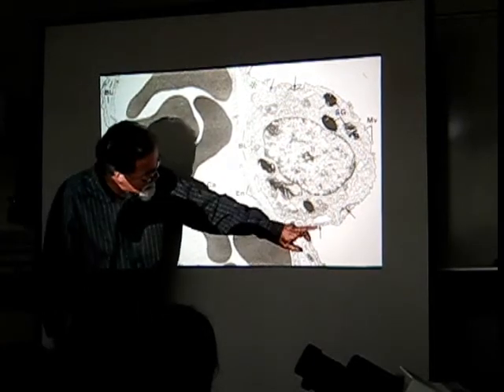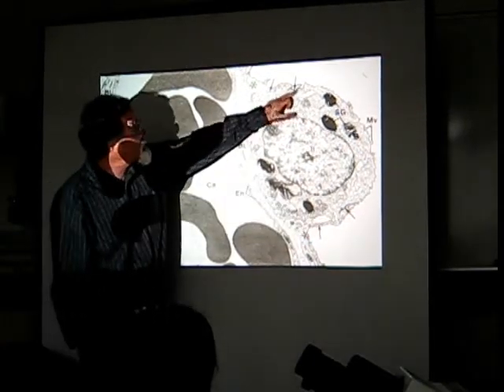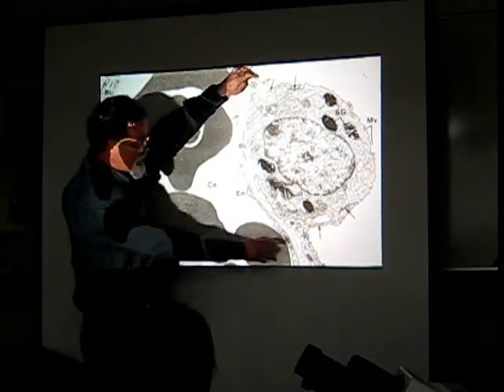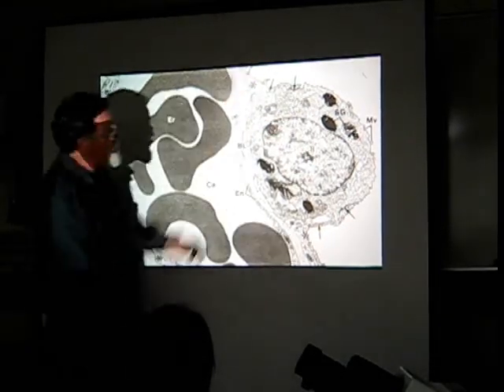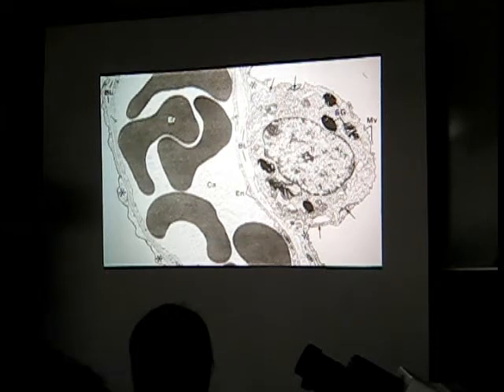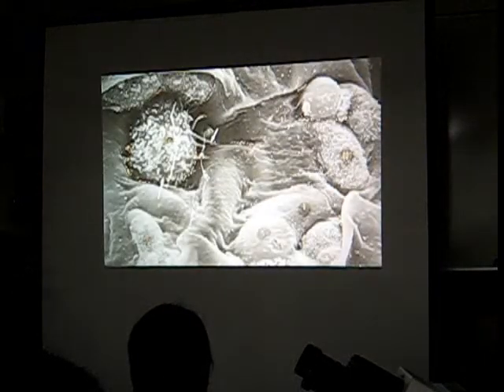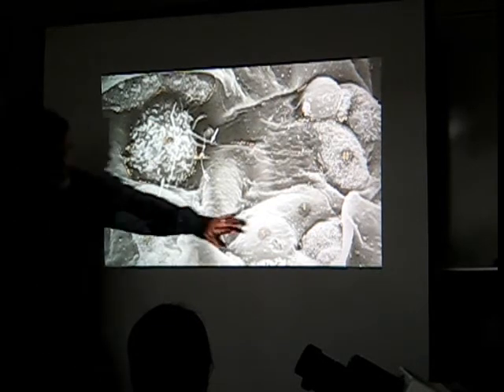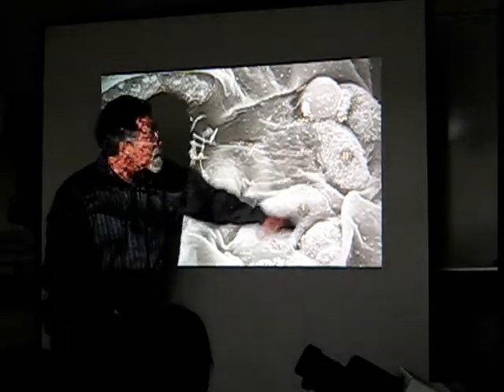Note that right here and here, as well as here and here, are tight junctions between this type 2 cell and type 1 cells on either side. And you can see nicely the secretory granules that contain surfactant, it's kind of like an accordion. Once it's extruded, it just flattens, opens up, and then covers the whole alveolar surface. And this is a crappier version of what I showed you. You can see the dust cell here. Get a sense for the type 1 and type 2 pneumocytes.